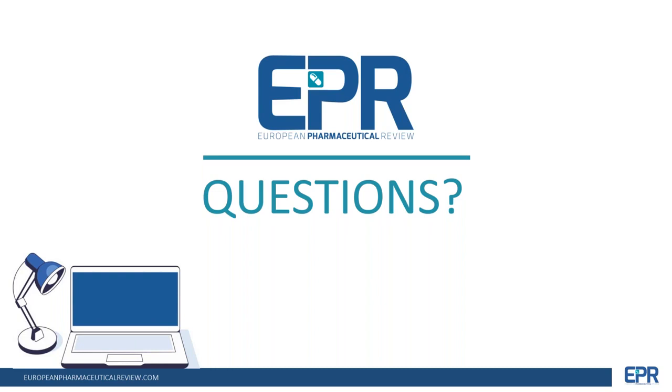Brilliant, thank you. Okay, another question. Somebody is asking, have you observed any limitations in the size of the oligo that can be analyzed? Do you have any more information? So I can say that we have analyzed oligos as large as 100-mers, and we have observed peaks, and we have successfully deconvoluted that data to get the right mass. We haven't really explored oligos that are bigger than that yet, but I would imagine that the constraint would be more on the mass spec side than the ZipChip side. So as long as you have the right mass spec method that goes with the separation method, I would imagine that you can easily analyze larger oligos as well.